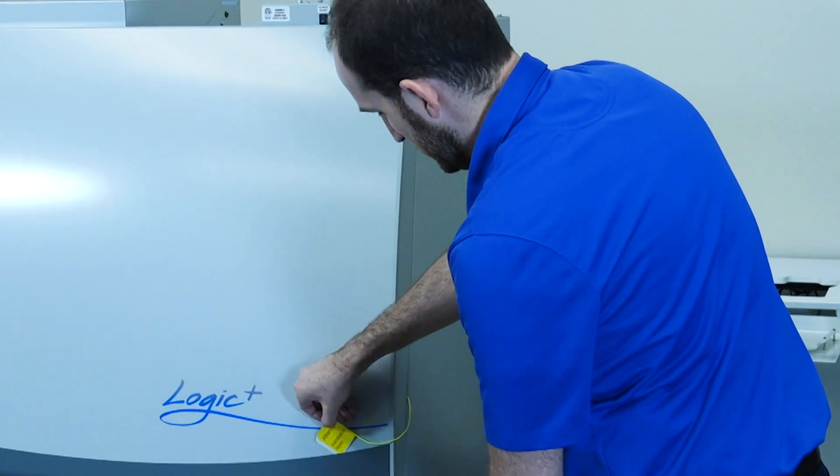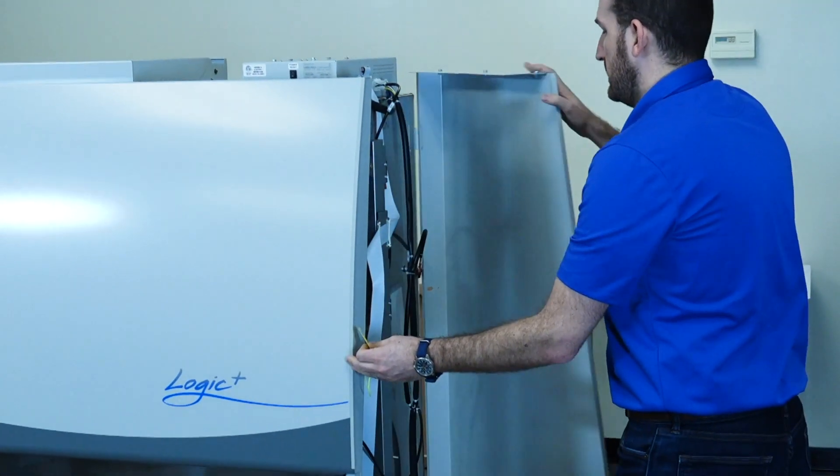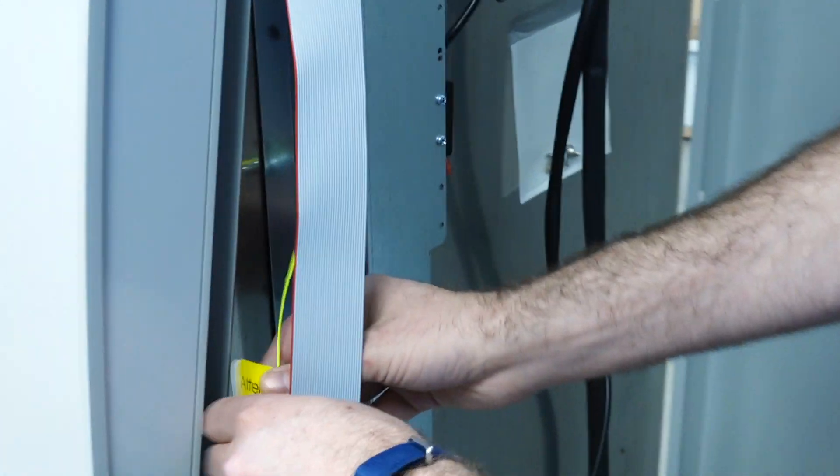Next, remove both sash pins. Locate each pin by following the yellow string from the front of the BSC back to the side panels. Firmly pull both pins to remove.